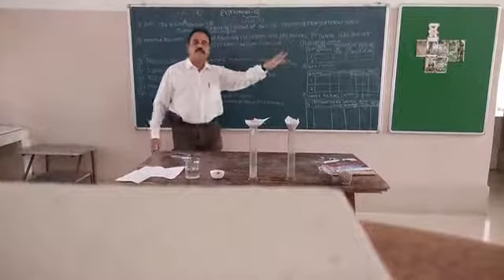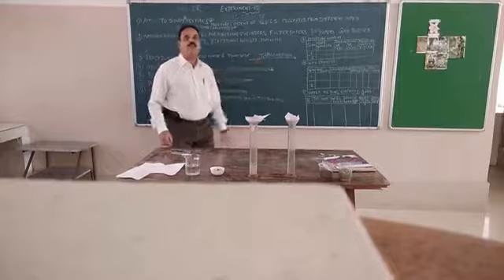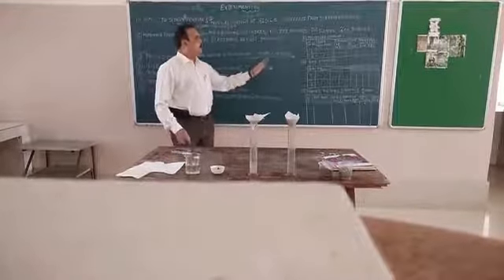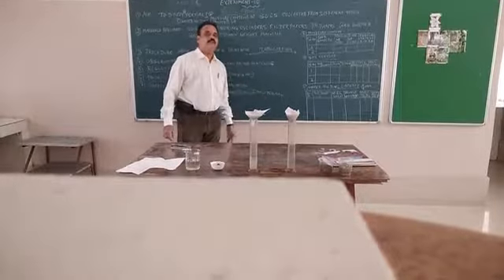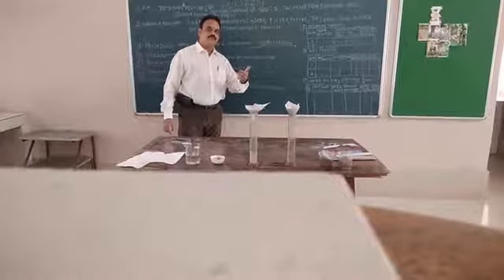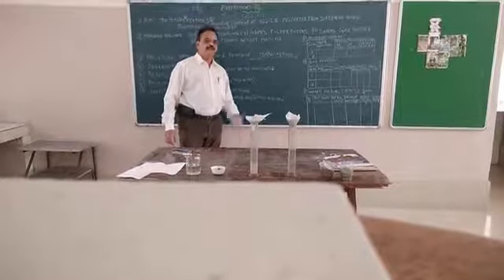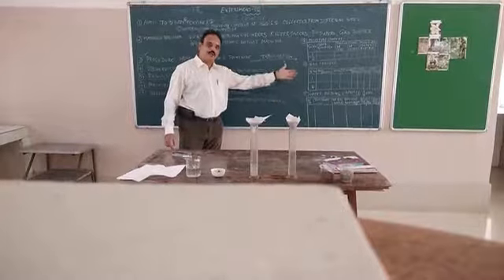I am sure sons of all the farmers will be very happy to perform this experiment so that you can help your parents and raise the output of the yield in your own field. So while coming back to school, all the children of farmers, you can bring 100 grams of soil of your field so that we can test what I am going to demonstrate today.